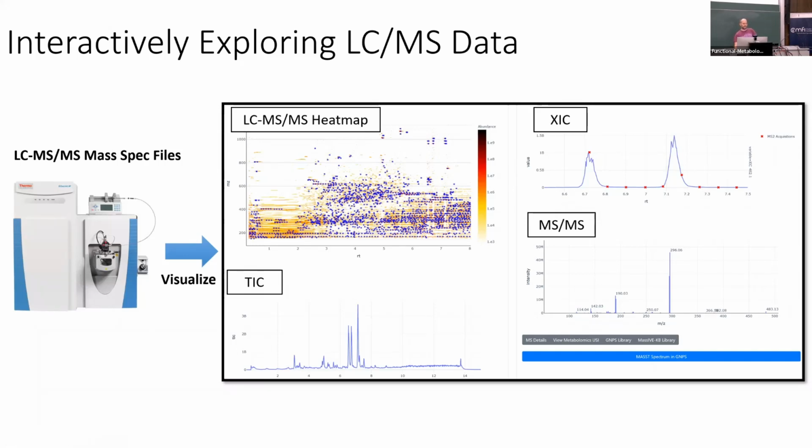Right? And here, we talked a little bit about DDA and exclusion lists and the distribution of MS/MS throughout your analysis. I think this is a very nice and intuitive way to immediately see where my MS/MS was placed. How was my coverage there, right? If I would see only lines in there of a few features, then I would say, okay, maybe there was something not that great. And having this available to inspect public data quickly was actually one of the take-home messages for us, that a lot of people do not have that set properly.